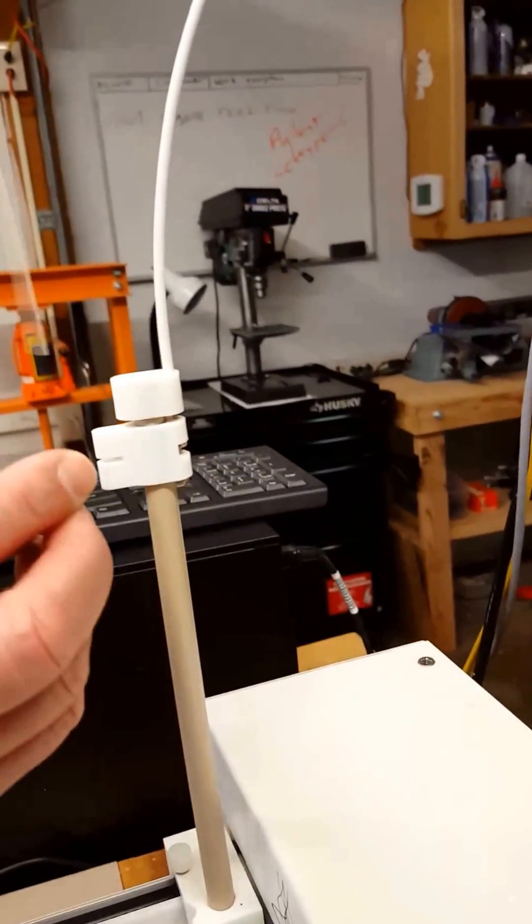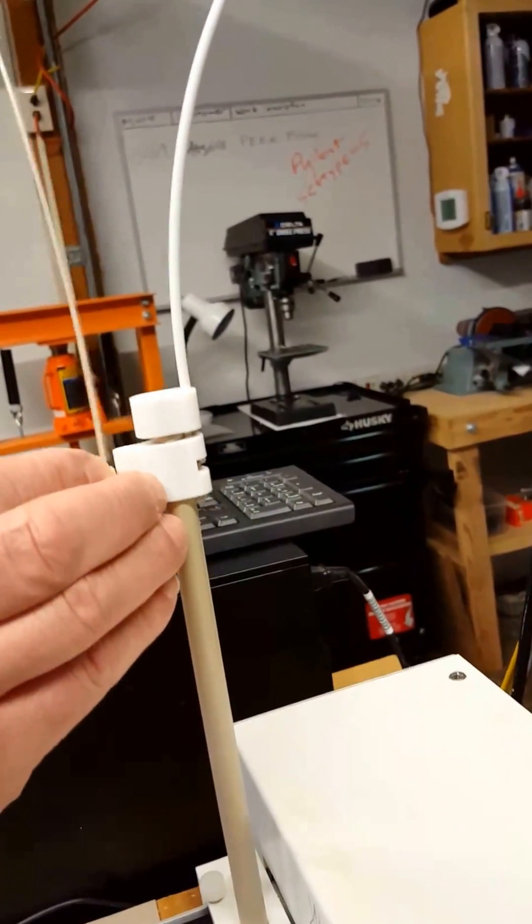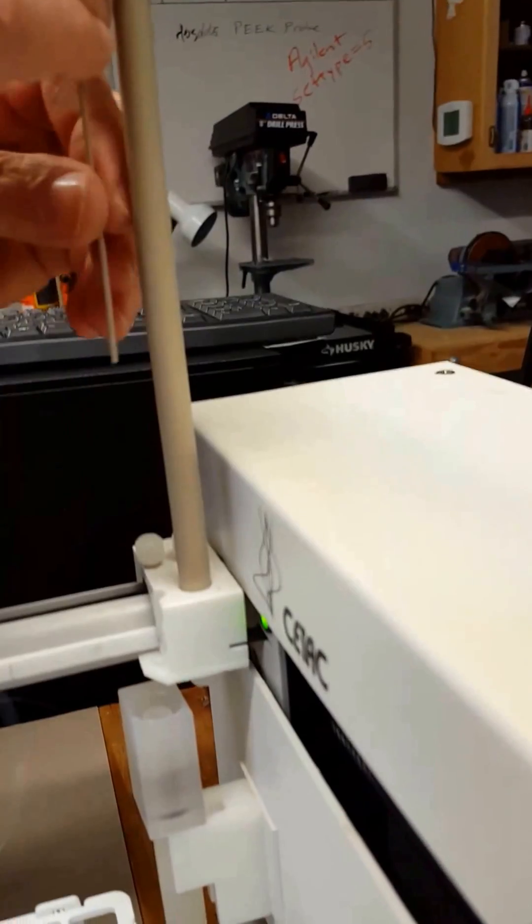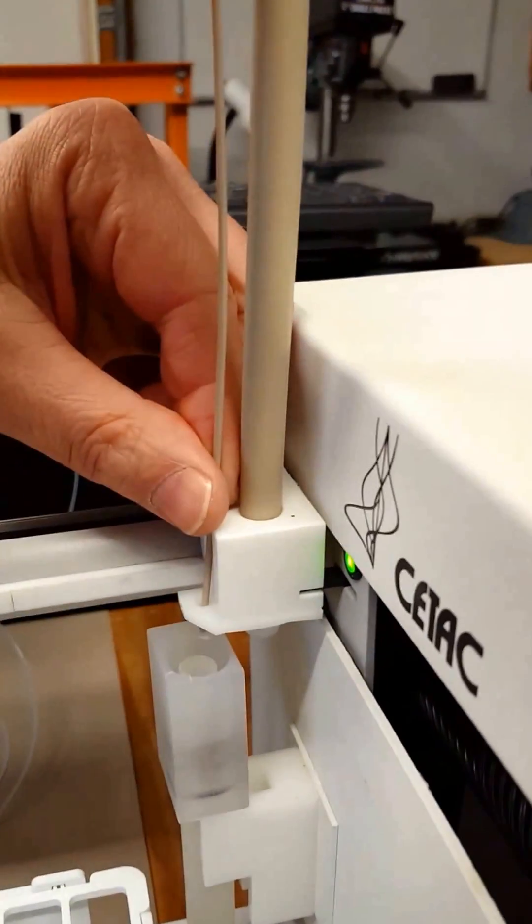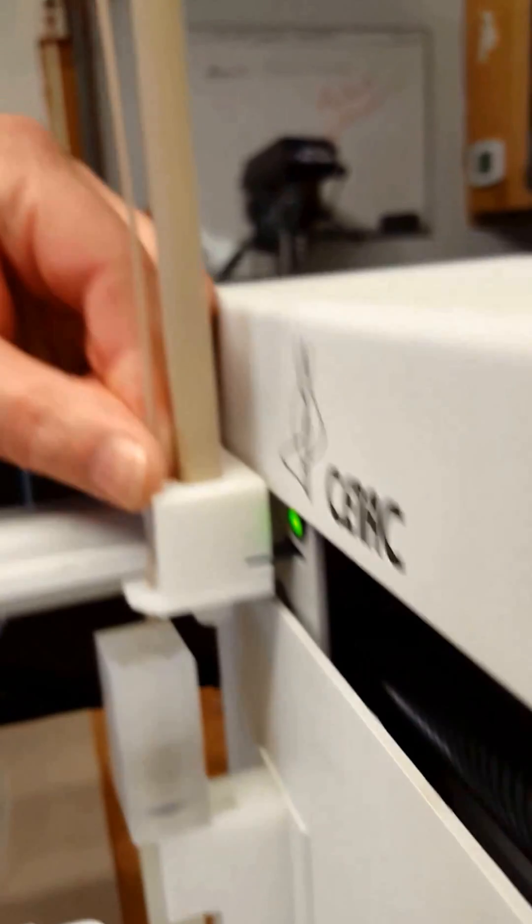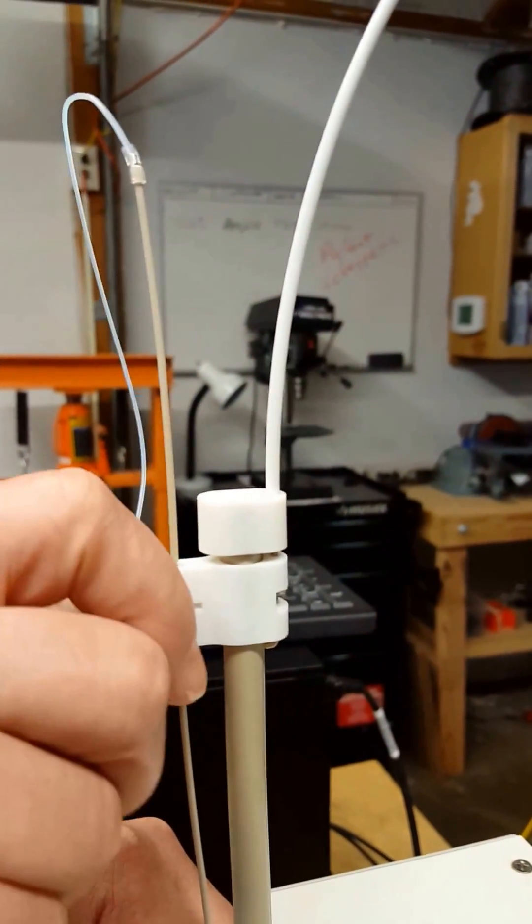Feed the probe through the slot and the specialized nut. It goes down through the hole in the peak probe plate and should be positioned about halfway to the reservoir. Then secure the nut down.